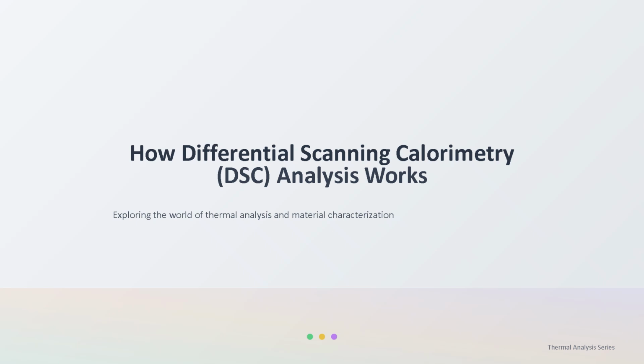Welcome to our thermal analysis series. Today we'll explore how differential scanning calorimetry, also known as DSC, helps scientists understand how materials behave when they are heated or cooled. This powerful technique allows us to study the hidden thermal properties of materials used in pharmaceuticals, polymers, food, and metals.